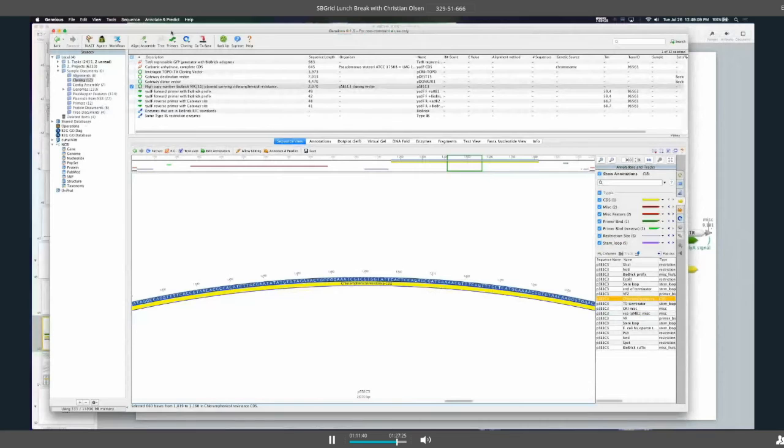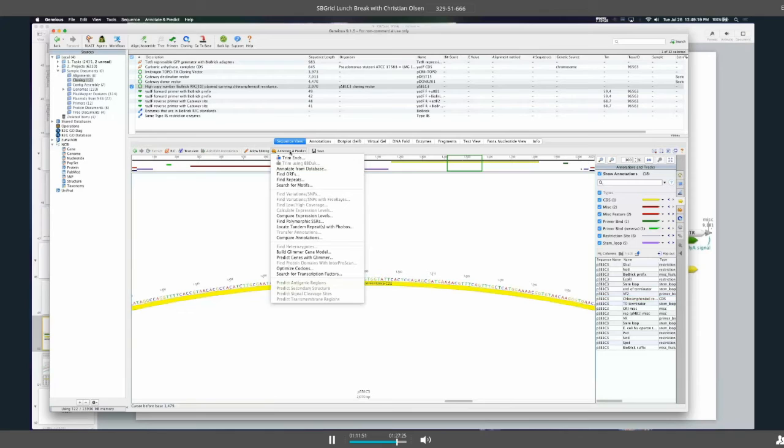Now, when we design Geneious, we design it for the masses, and since people use software in different ways, we've put our annotation tools in a couple of different places, but they're the same. Underneath this Annotate and Predict button, I've got a menu list of annotation tools.